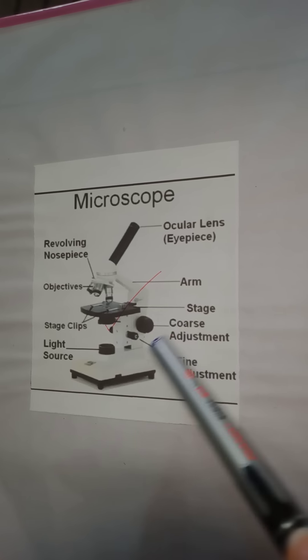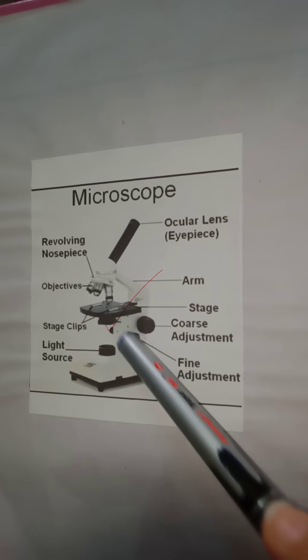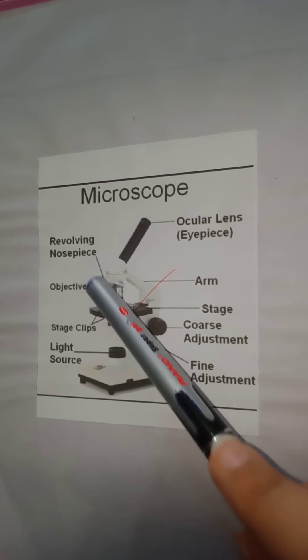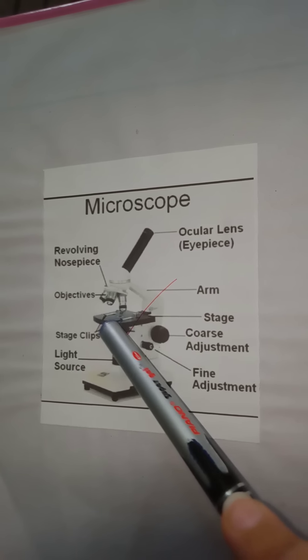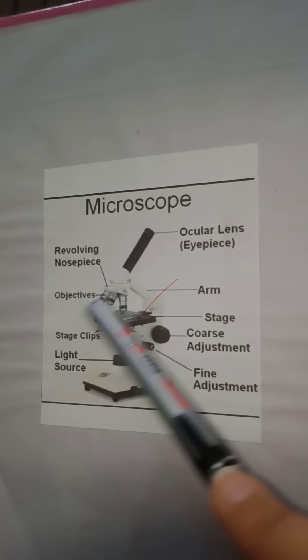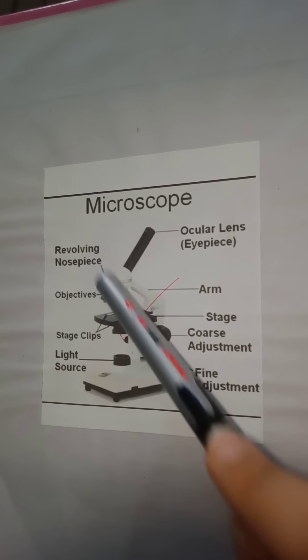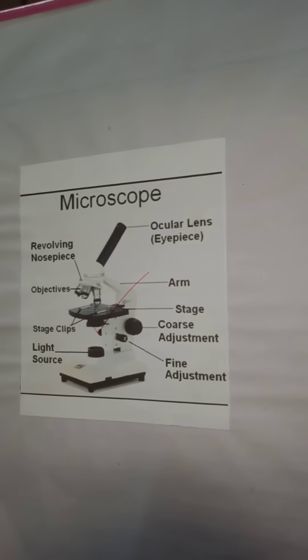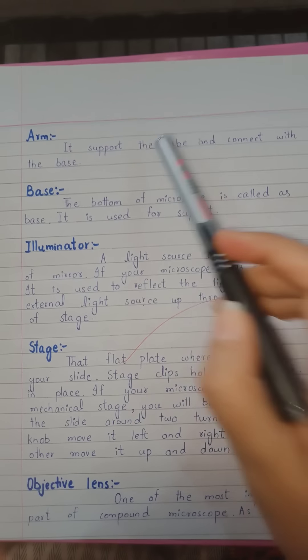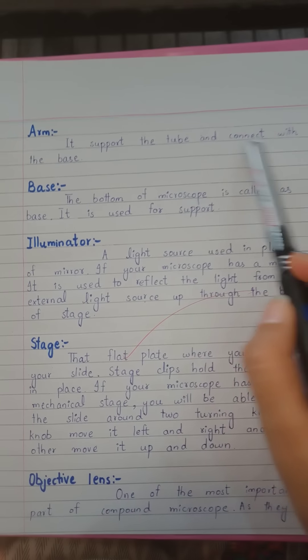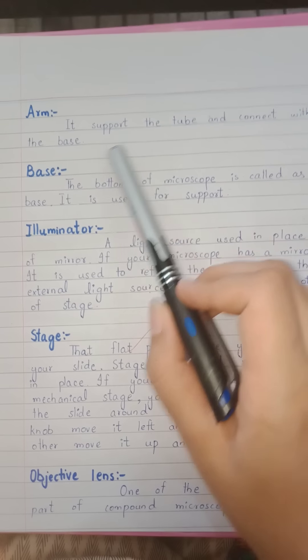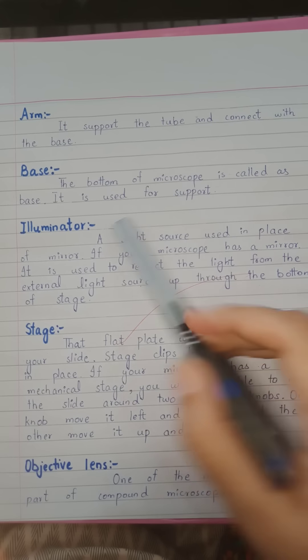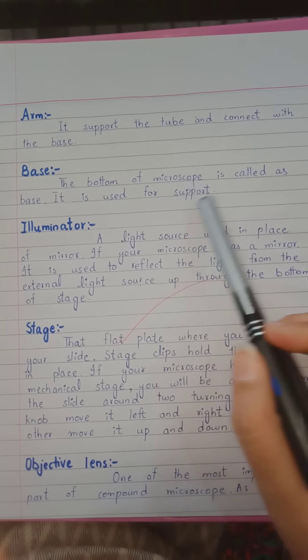This is the stage, this is the coarse adjustment, this is the fine adjustment, this is the light source, these are the stage clips, these are the objectives, and these are the revolving nosepiece. The arm supports the tube and connects with the base. The bottom of the microscope is called the base.